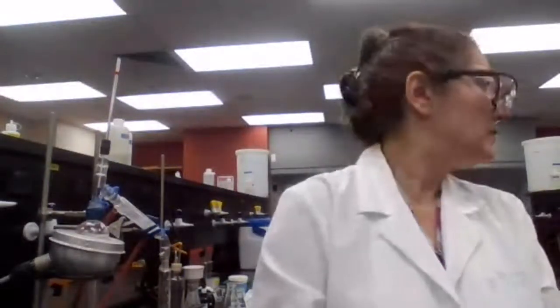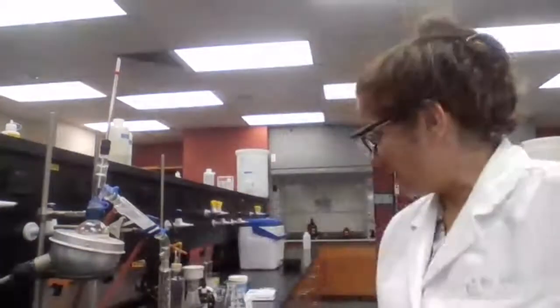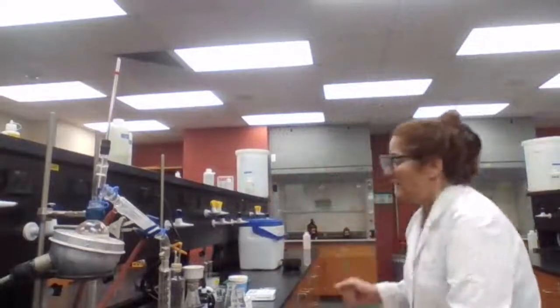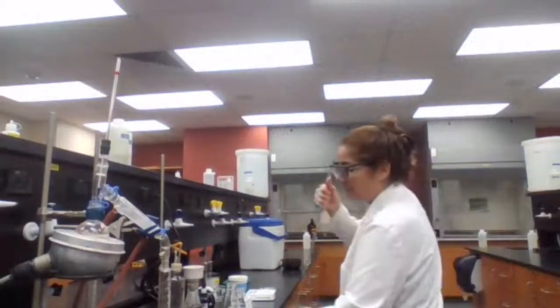What's the next step after distillation? So I should get ready for it. What should I do? Transfer to the separator funnel. Okay, so I'm going to go ahead and prepare my setup for the separator funnel.